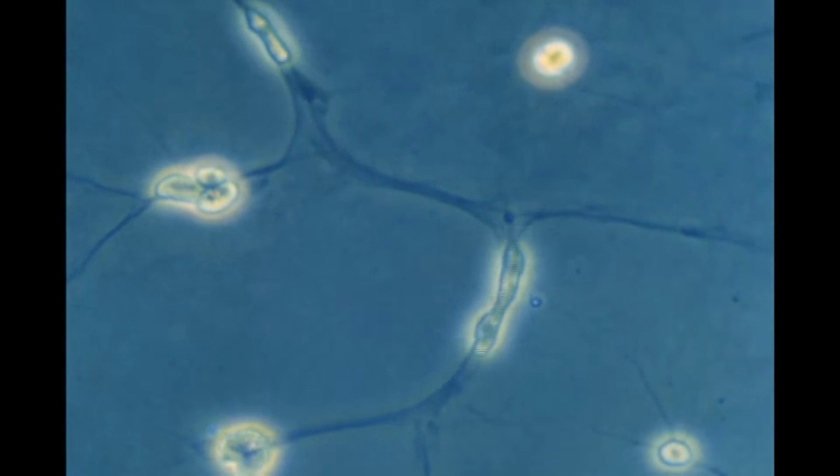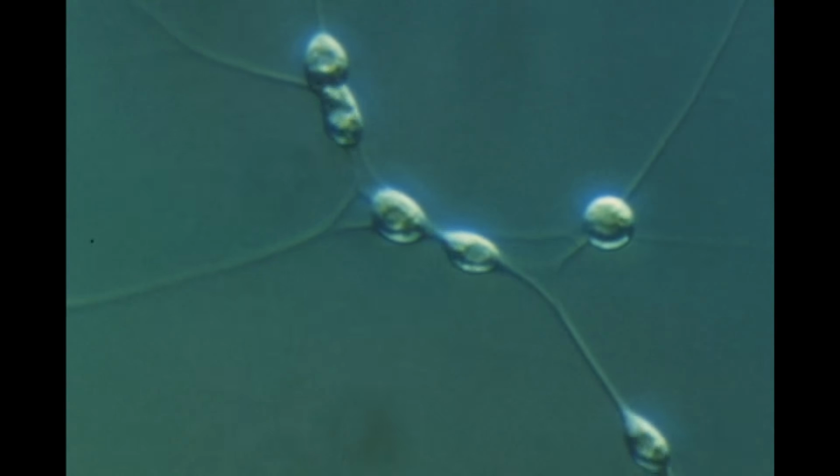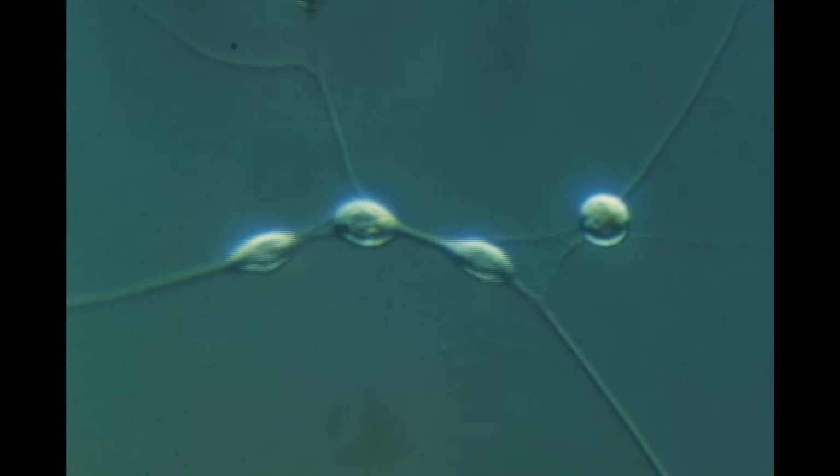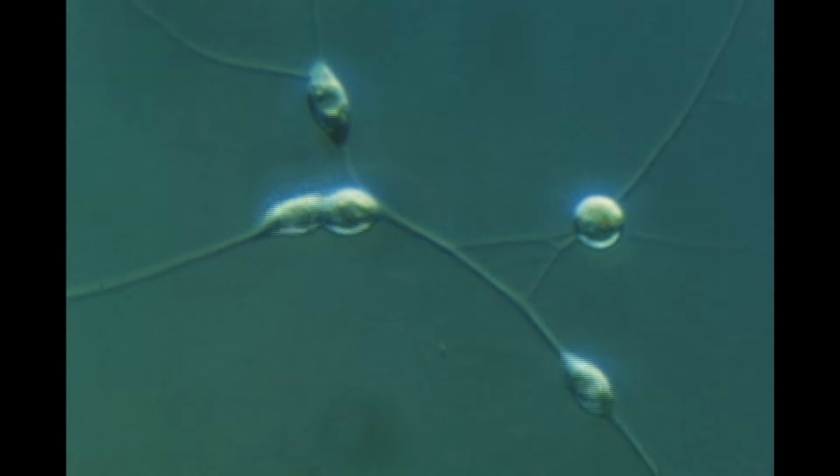A moving cell is able to glide past a stationary one without leaving the strand. The strands of the network seem to be semi-elastic. No additional material appears to be added to the strands as the cells move through them.